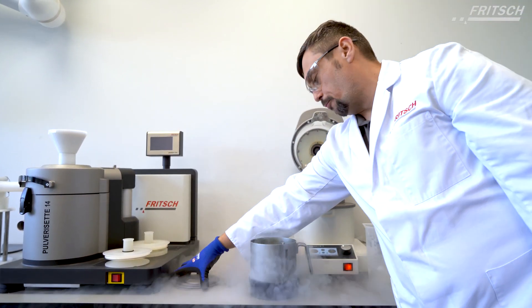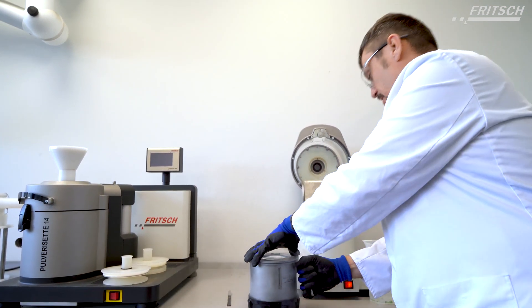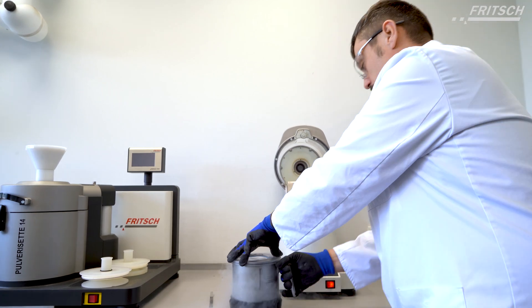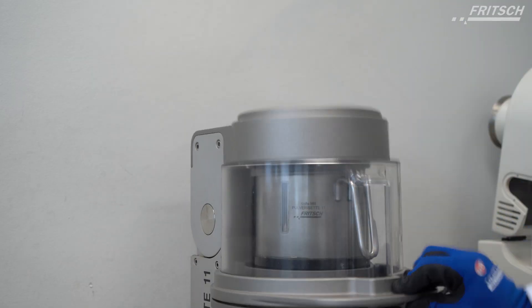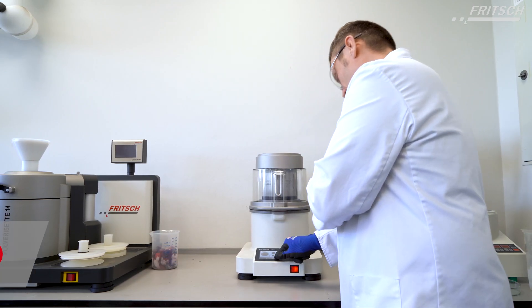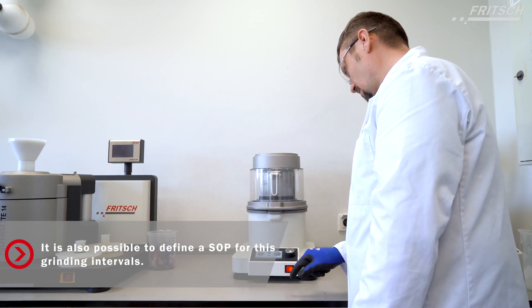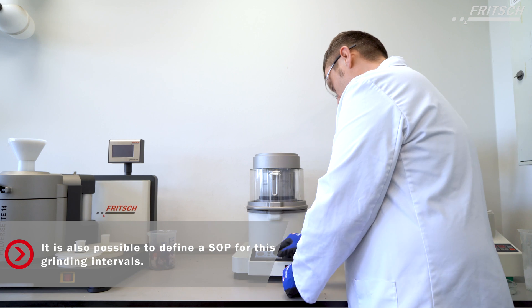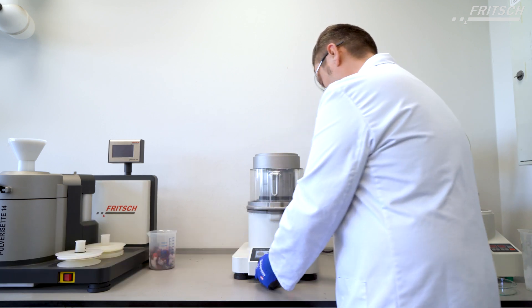Now we have to work pretty quickly not to evaporate the whole sample. The first thing to do is to remove the sample from the bottom of the bowl.